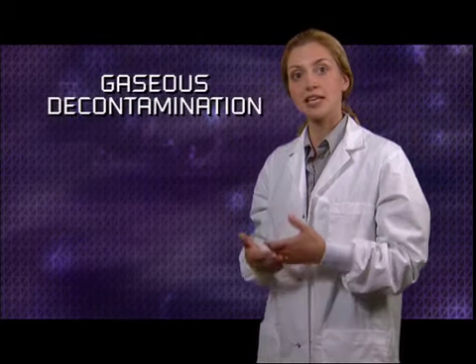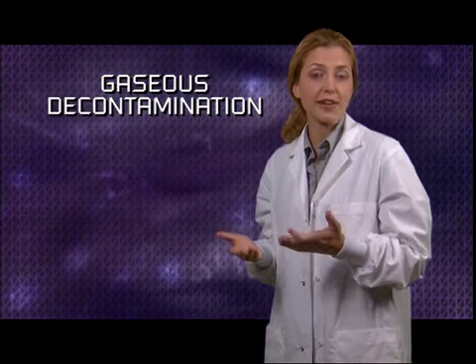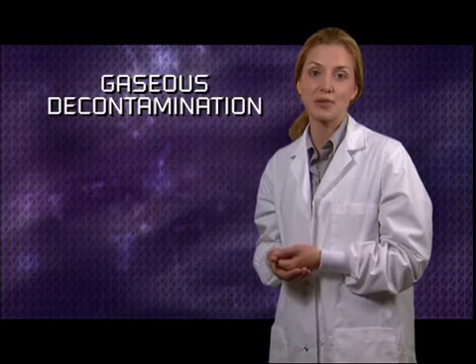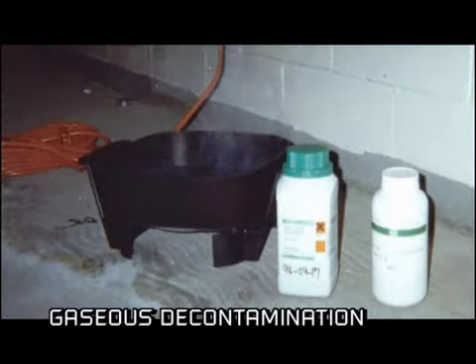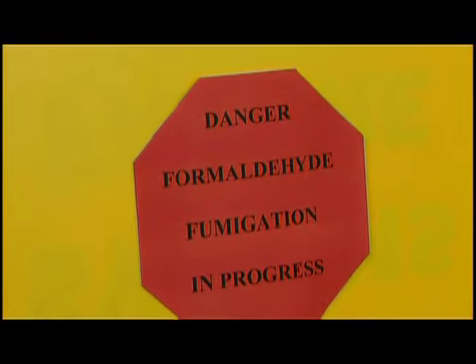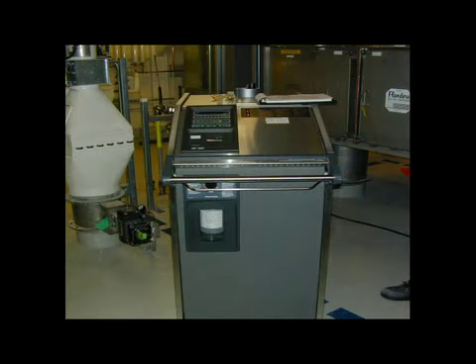Gaseous decontamination of the Containment Level 3 lab is only done under particular circumstances, about once a year, for maintenance work and before retesting of heating, ventilation, and air conditioning control systems. But after a major spill, when you have to decontaminate the entire Containment Level 3 lab, fumigation with formaldehyde is currently the most common method. Because of the potential for exposure to the hazardous chemicals used, this procedure should be done only by highly trained personnel. New decontamination technologies, such as vaporized hydrogen peroxide, can be considered, subject to validation and approval from the regulatory authorities.